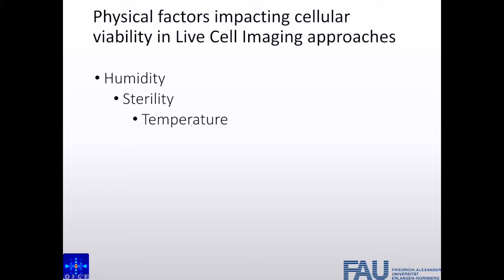Temperature, for me, I thought this is easy. I can incubate my whole system. I heat up the instrument 3 hours before I start the imaging, and then I have stable conditions. I will refer to that. I have some data which I was really astonished by, and I never thought that there might be such a temperature bias that I cannot really control in normal incubated imaging systems.